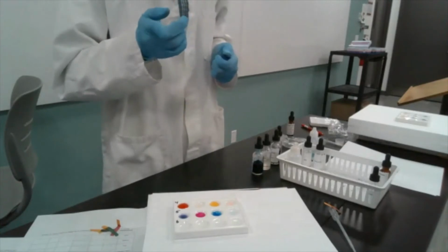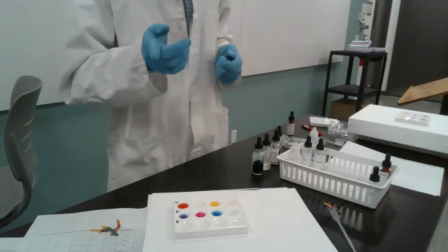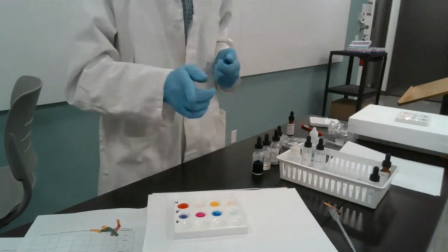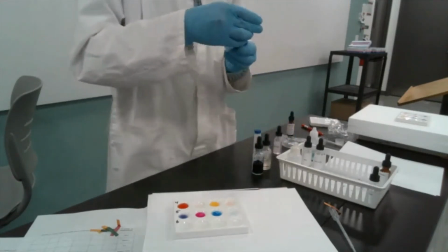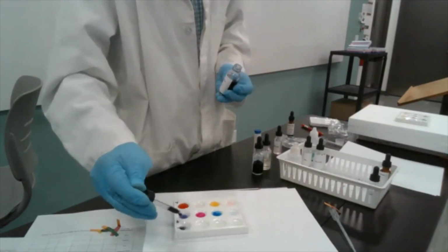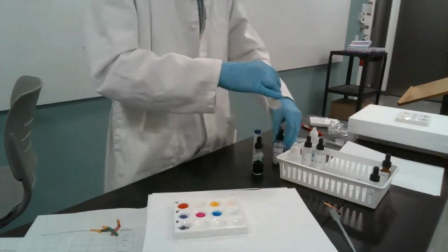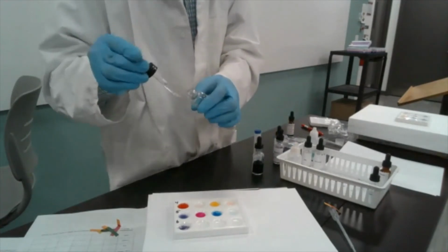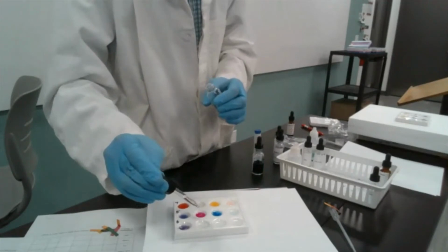Let's see, pH-wise, what typical hand soap looks like. So I'm going to add blue litmus, followed by phenolphthalein. By now, we notice that it tends to respond to basic substances quite dramatically.